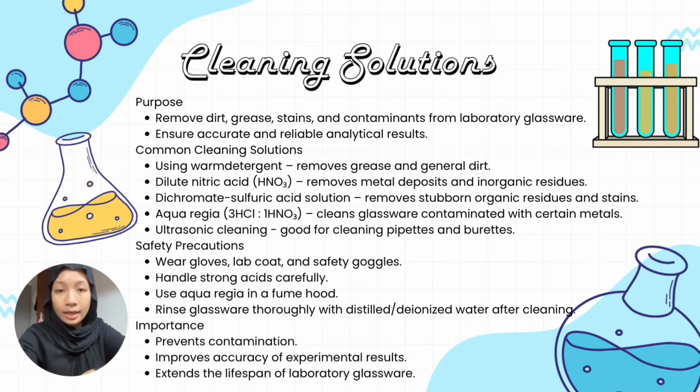So this slide explains the importance of cleaning solution used in analytical chemistry laboratories. The main purpose of cleaning solution is to remove dirt, grease, stain and other contaminants from laboratory glassware. Proper cleaning is essential because any residue left on the glassware can affect the accuracy and reliability of experimental results. There are several common cleaning solutions used in the laboratory.